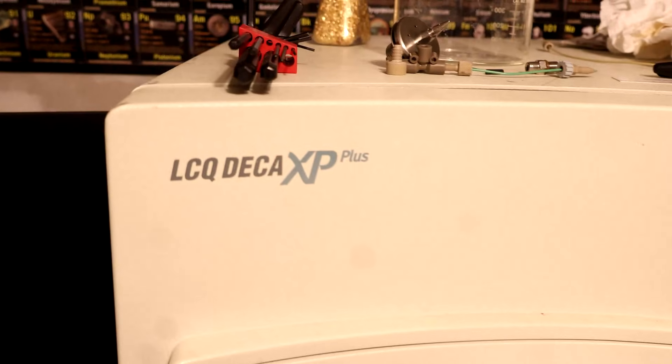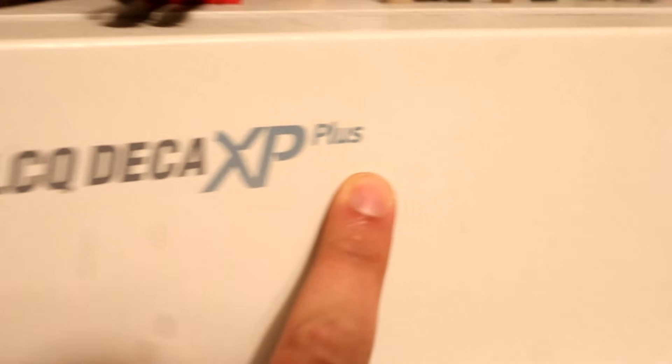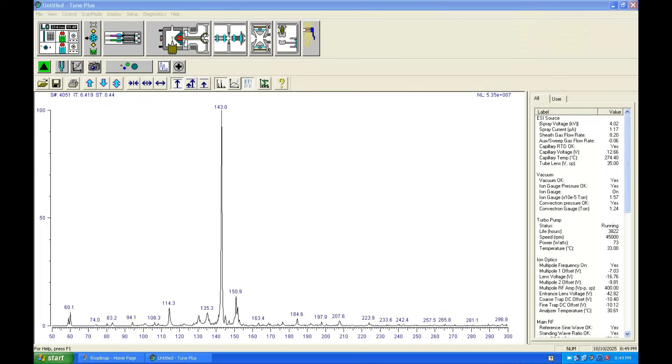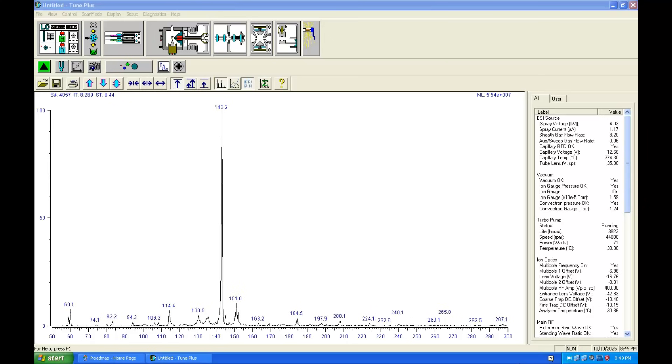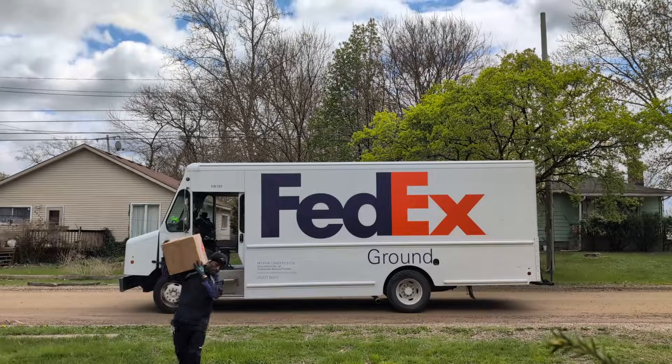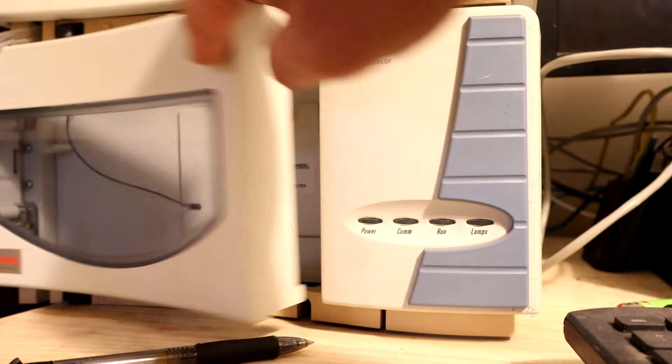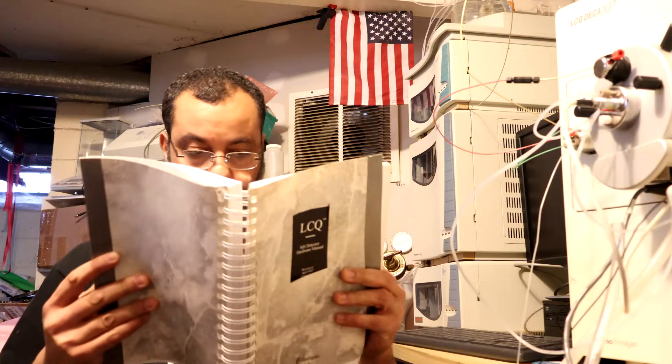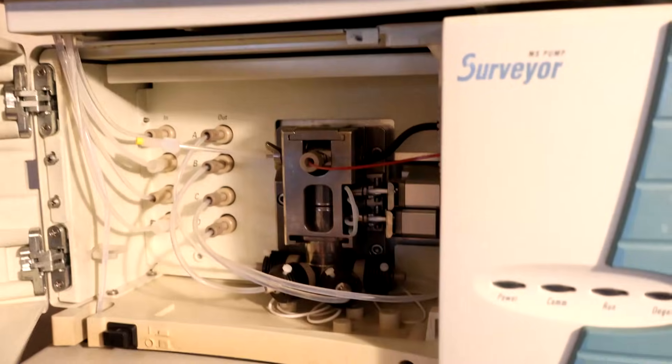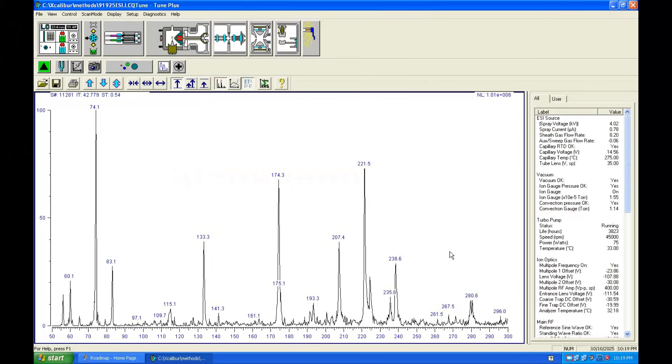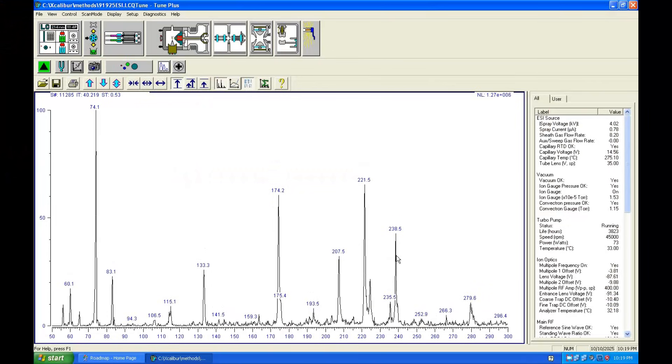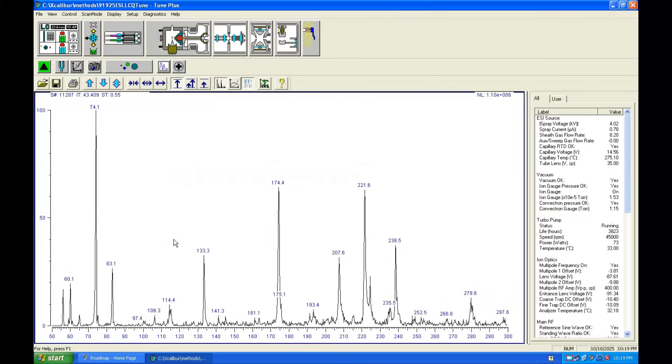This is the Thermo Finnigan Deca XP Plus, meaning it has bigger separating power than other previous models. This is a very heavy unit and it came with its autosampler, PDA, manuals, MS pump, two ion sources, the PC and software for a complete LC-MS setup.